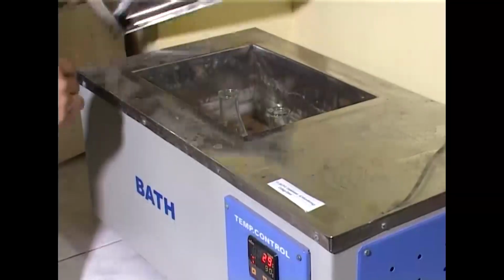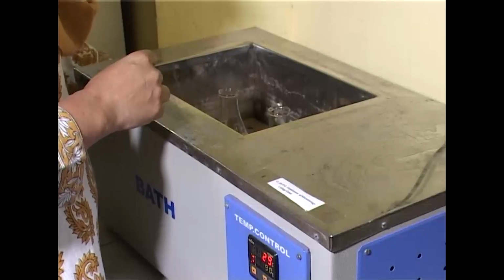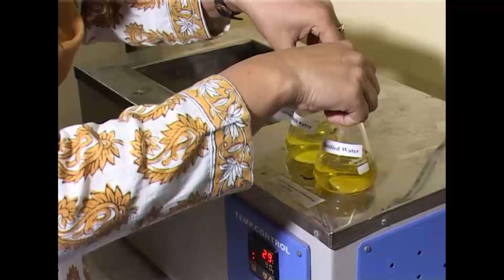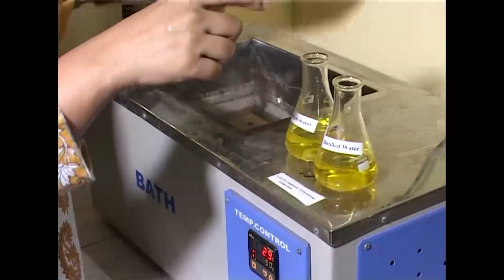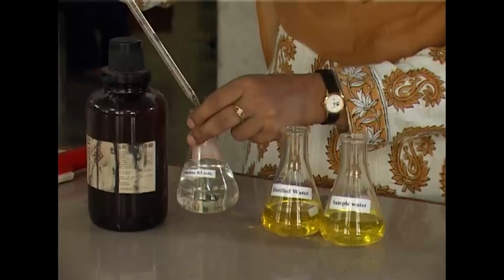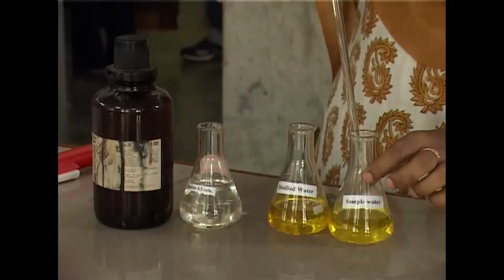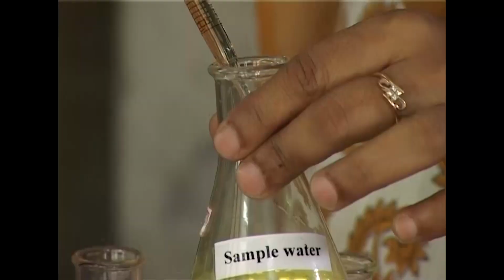Now after this, we remove the flask. That means after 1 hour of incubation at 100 degrees Celsius in a water bath, we remove the flasks and let them cool, and then we go on to the next step where we add 5 ml of the potassium iodide solution along with 10 ml of the sulfuric acid.